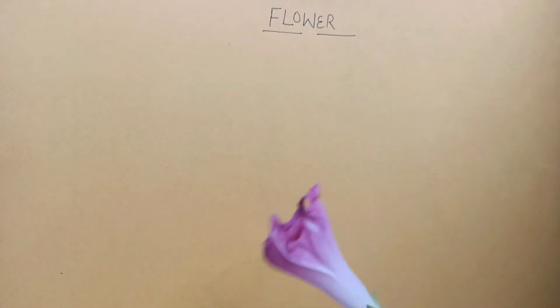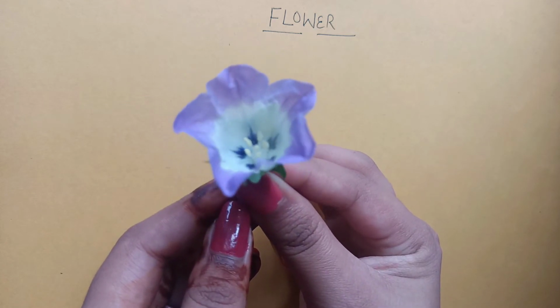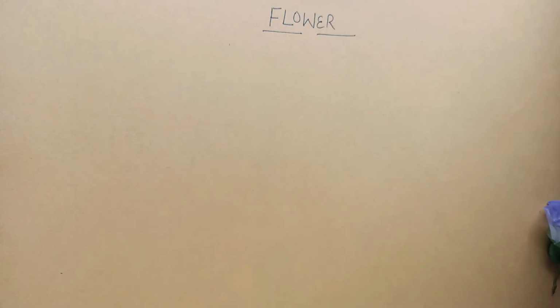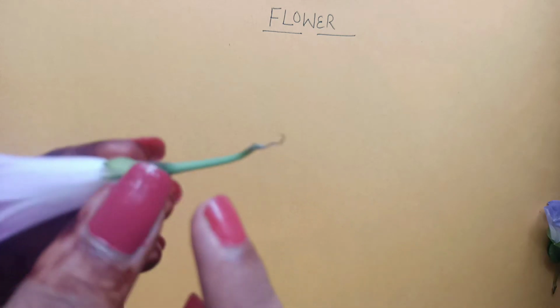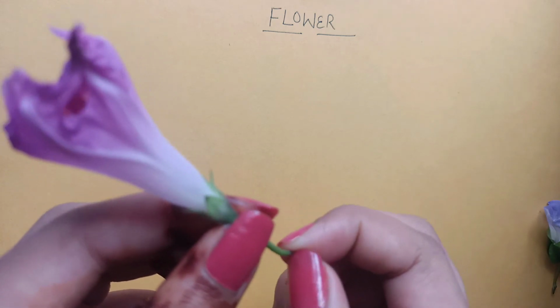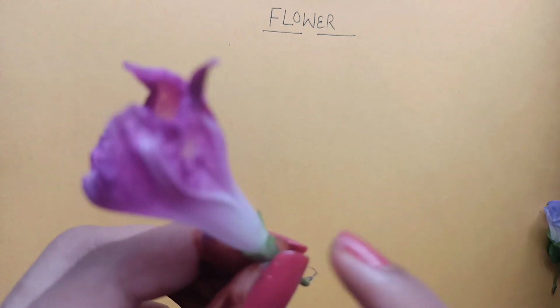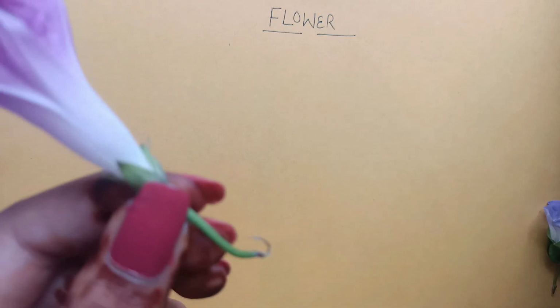So welcome back again. Now we are going to do the dissection of the flower. Over here you can see how beautiful it is, and you can see something inside that we have seen in our slides also. First, we studied the pedicel. You can see very carefully over here. This green colored stalk is known as the pedicel. What is the function of this pedicel? This pedicel attaches the flower to the plant. You can see this is the flower, it is attaching to the flower, and this part of the pedicel is attached to the stem.